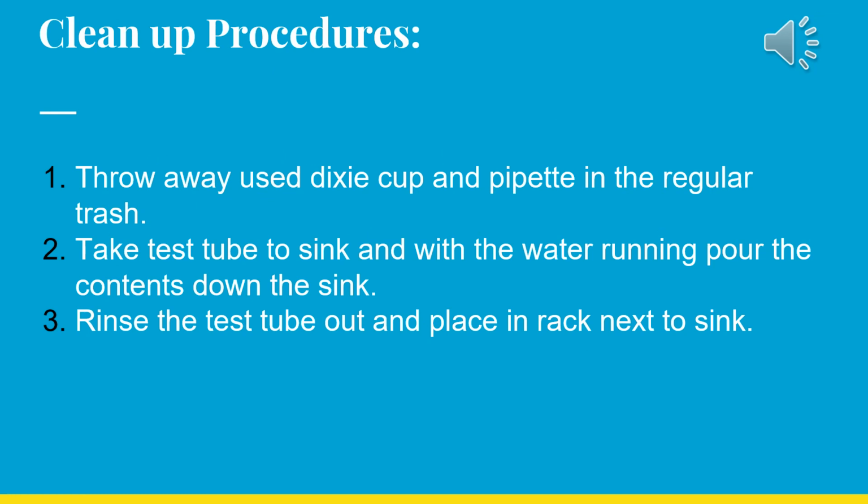Cleanup procedures. Throw away the used Dixie cup and pipette in the regular trash. Then take your test tube to the sink and with water running, pour the contents down the sink. Follow that by rinsing the test tube and placing it in the rack next to the sink. As with any lab procedure, please leave the room clean and tidy.